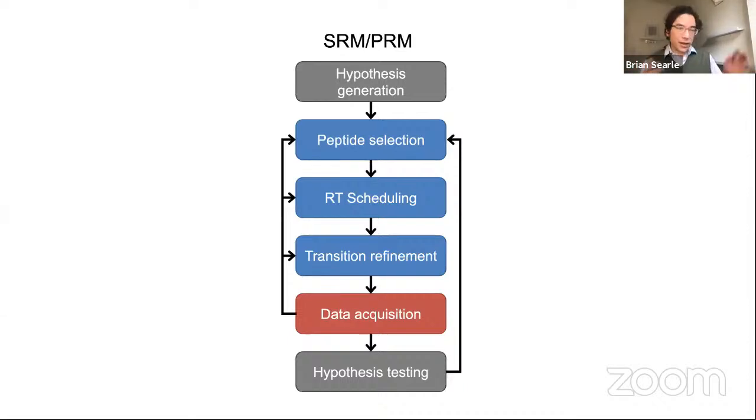Now there are combinations of boxcar plus DDA or boxcar plus DIA that make it possible to analyze, or interpret, the data that is collected for quantitative work in the same experiment.